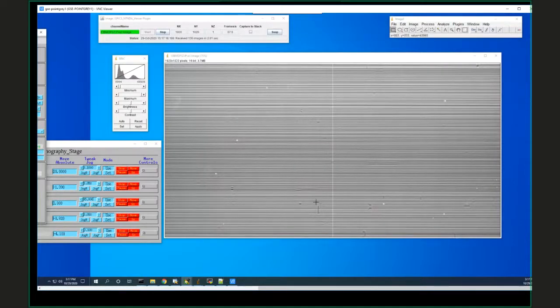You also see some darker areas here. Those are caused by some sort of defects in the mirror. I don't know if they're defects in the coating. This is a single crystal of silicon, 1.2 meters long and about 50 millimeters in the other two directions. It's highly, highly polished, and then it's coated with platinum. I don't know if these are defects in the platinum coating or defects in the mirror underneath, but the reflectivity isn't the same in these points. And I suspect the spectrum of the X-rays bouncing off of these dark areas is also different, because they don't normalize out and they lead to ring artifacts in the images. So the pink beam does have more ring artifacts, because there are more defects than the mono beam.